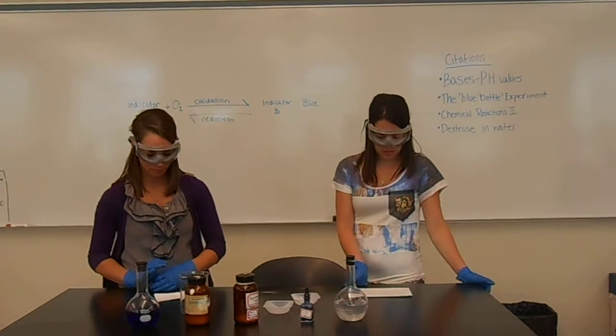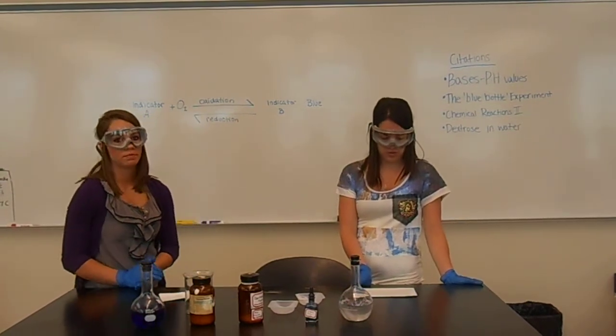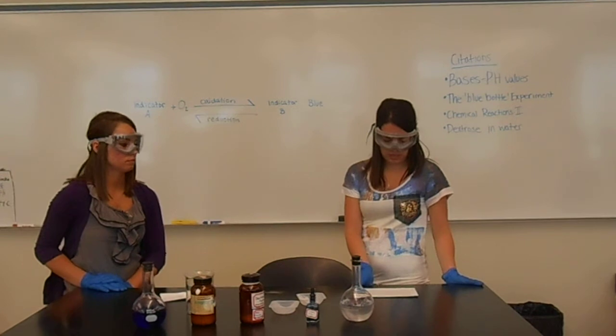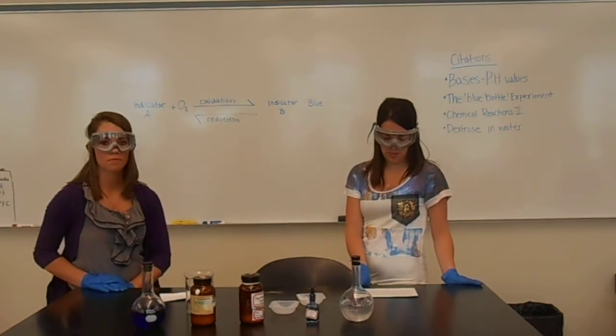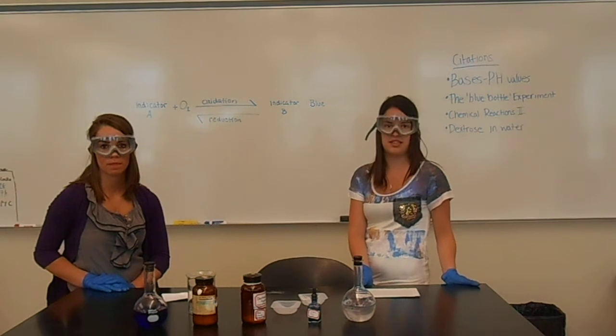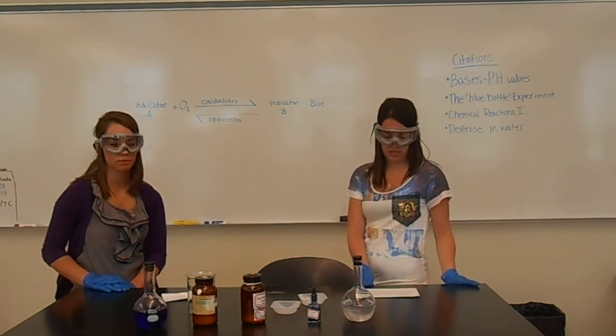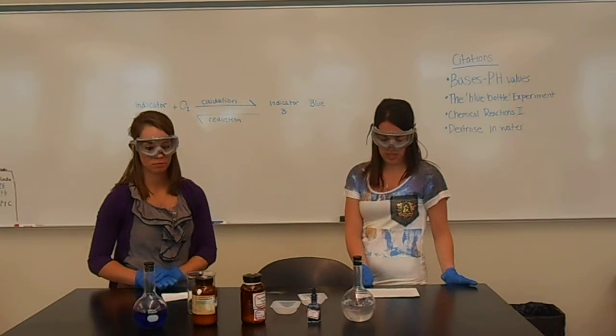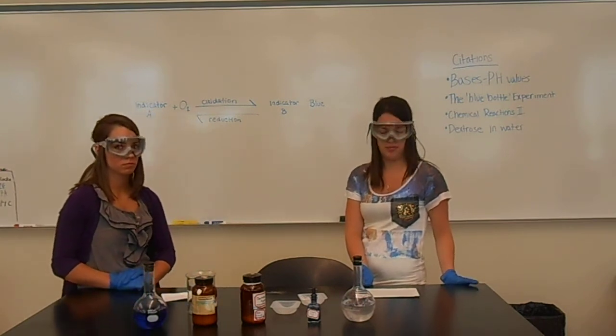Allowing the solution to stand alone allows the dextrose to reduce the methylene blue to its colorless state. This cycle can be repeated until all the dextrose is oxidized and all oxygen in the flask has been consumed. This demonstration illustrates a reversible redox reaction between oxygen and methylene blue.